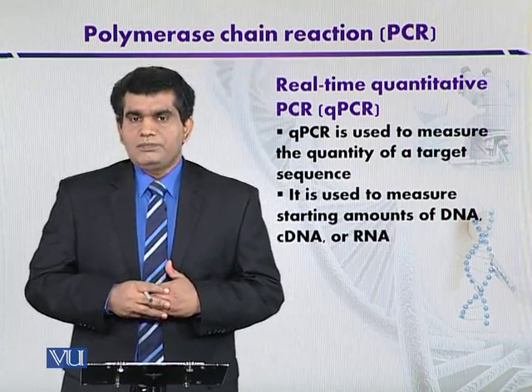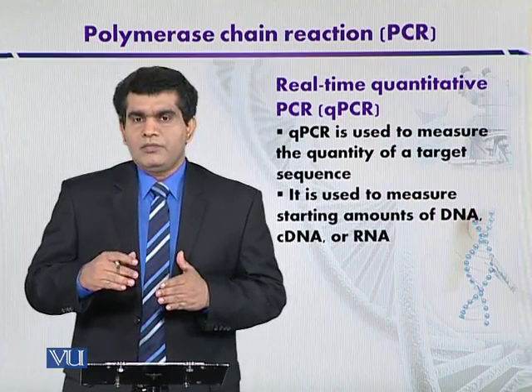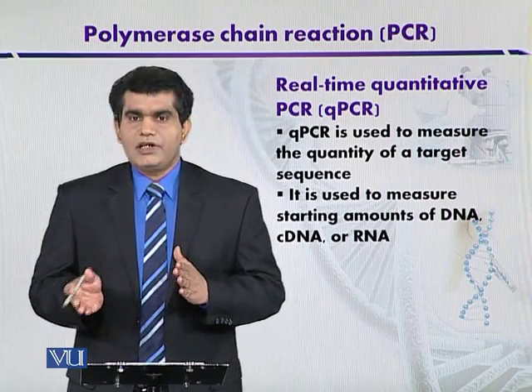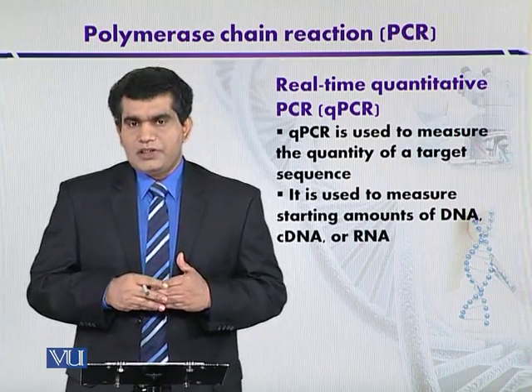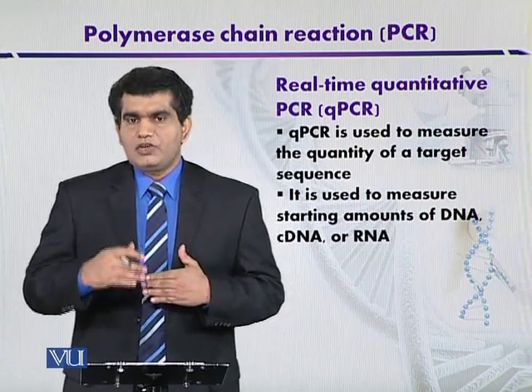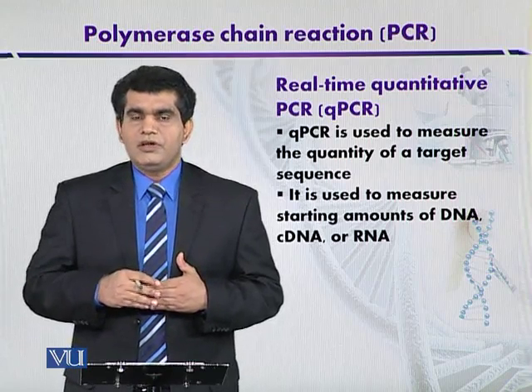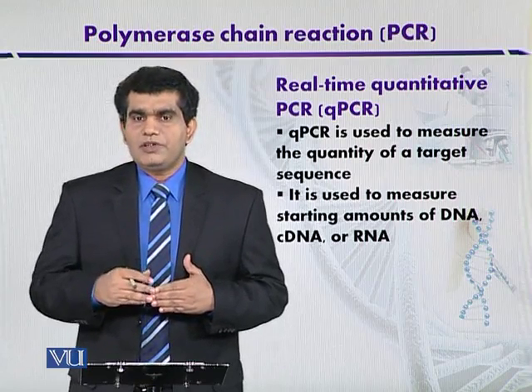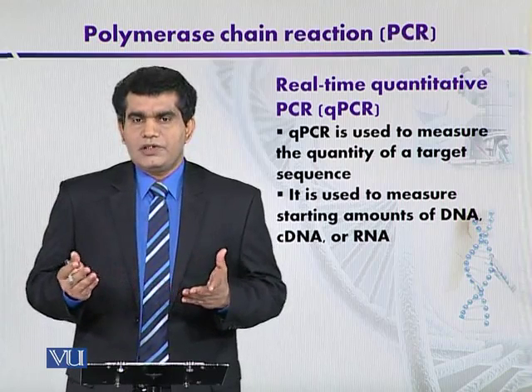At the same time, I would like to add one point: this real-time quantitative PCR, sometimes students or some workers can confuse it with RT or reverse transcriptase PCR, but this is not the situation. Although RT-PCR can also be used in the quantification of RNA by using competitor RT-PCR, this real-time quantitative PCR is primarily used to quantify the nucleic acid.